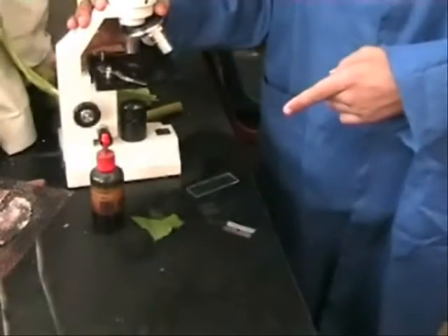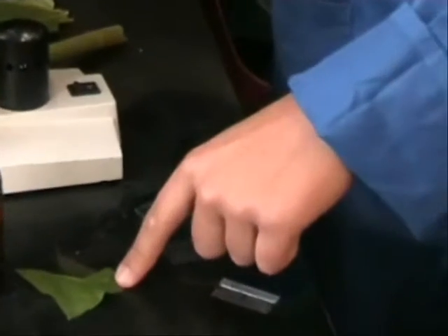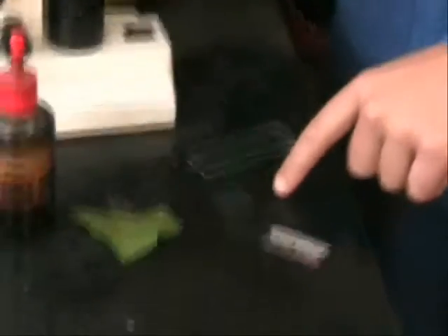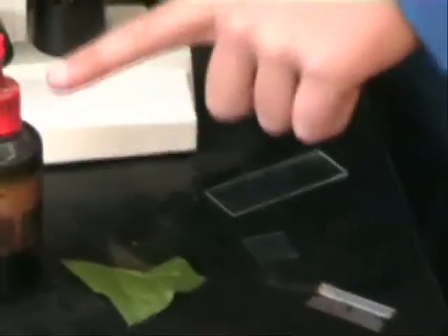You will need five things: a razor blade, a piece of rhubarb leaf, a cover slip, a slide, iodine, and a microscope.